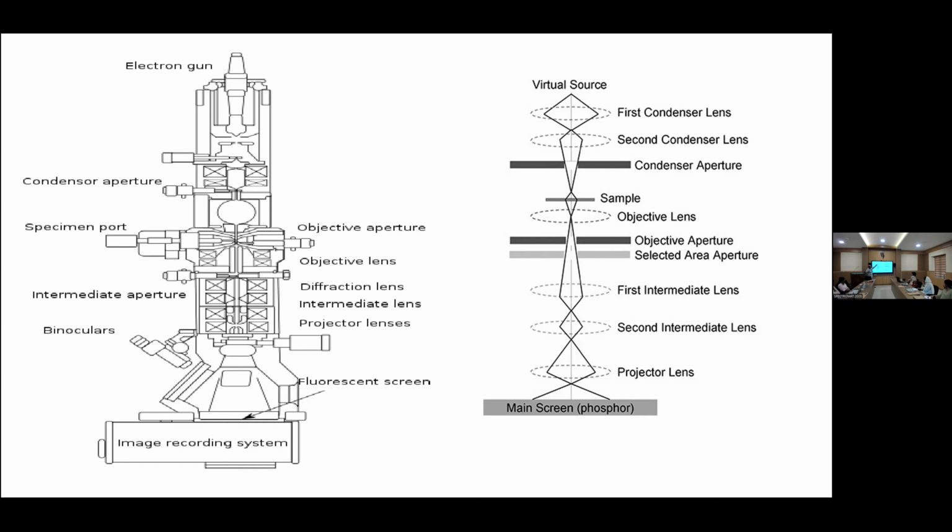Not only one condenser lens. In the condenser lens section itself, there is an array of lenses. That is to control the magnification as well as the aberration corrections. For those things, we are using multiple lenses. And on the objective side also, we have multiple lenses: the objective lens, projection lens, intermediate lens. In the objective lens, we get this image. But there are different planes.